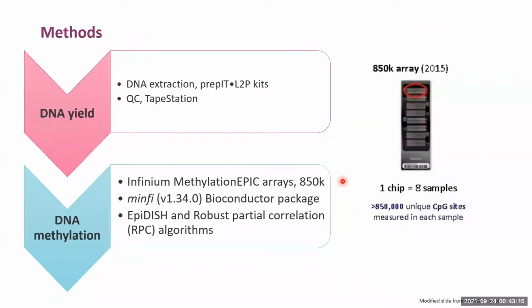After that, genomic DNA was extracted following the manufacturer's protocol, and DNA quality was measured using a TapeStation.